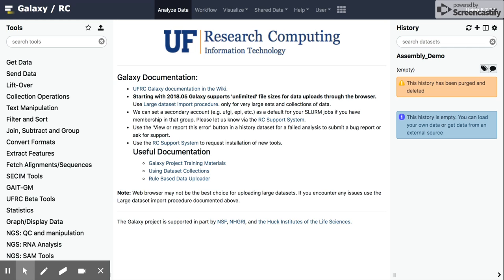Hello again. In today's short video, I'm going to show how to run a workflow on a paired set of FASTQ files from a bacterial isolate that was sequenced on an Illumina MySeq instrument.